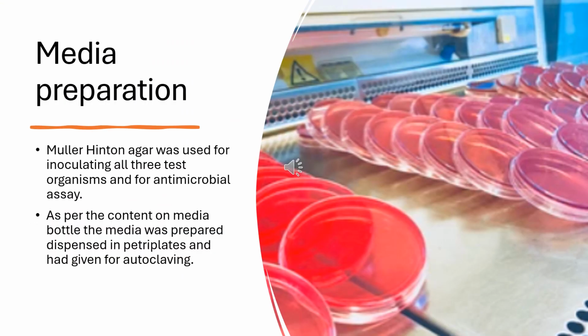Hello everyone, my name is Yashvi. I am going to discuss the next steps in the experiment. So the next important step in the experiment is media preparation. For this experiment, we need both well and disk diffusion. The best suited agar for it is MHA. The media was prepared with the instructions provided on the media bottle.